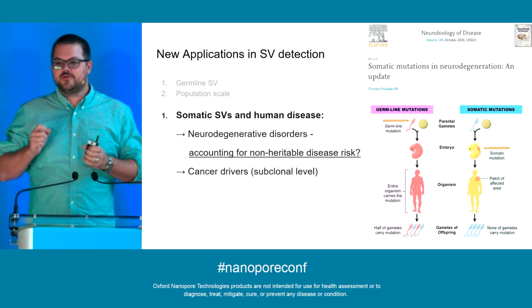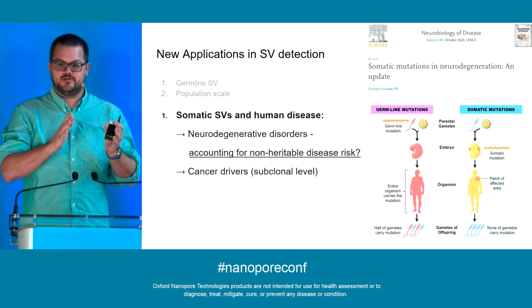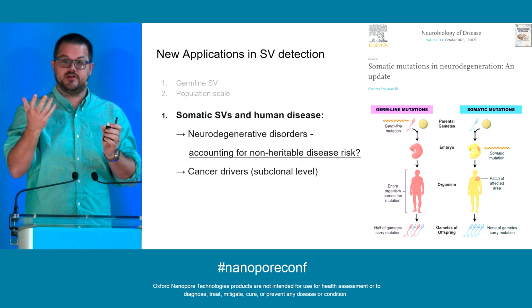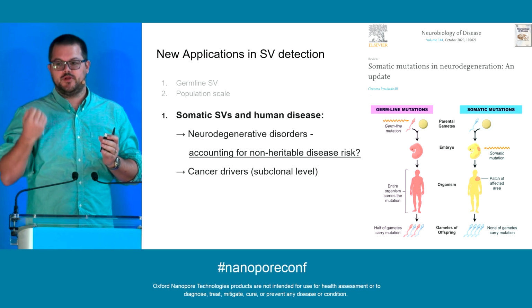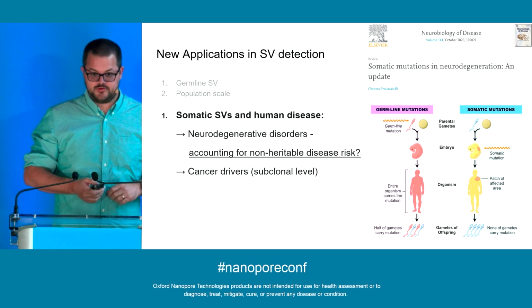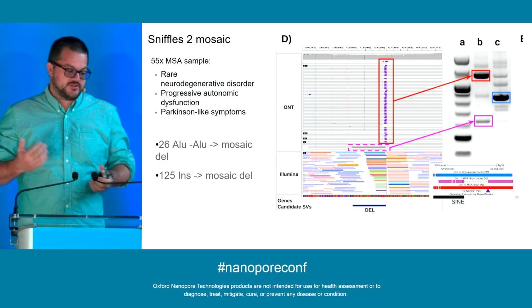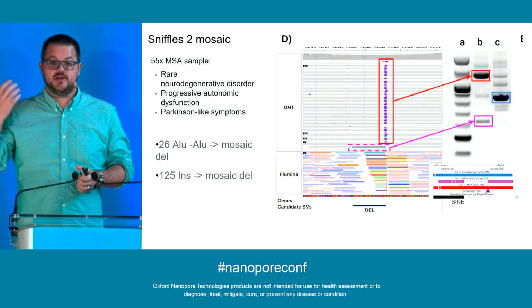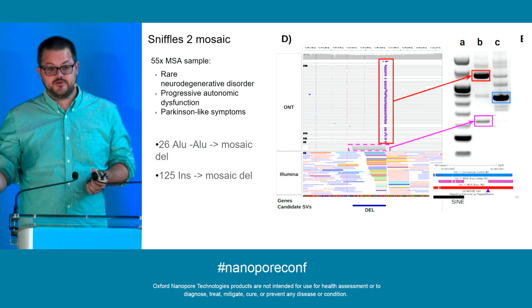What I mean with them is really low frequency within the tissue. You might have heard of tumor-normal comparisons, where we have mutations in a certain tissue, but maybe at high prevalence. But I'm really talking about low frequency mutations within the tissue, where you really have to go down into the signal versus noise and identify what you can really call. Through the Somatic Mosaic Consortium, SMaHT, we have now done benchmarks of calling structural variants down to 2% or 5% variant allele frequency, or even below that. This also depends on your coverage.